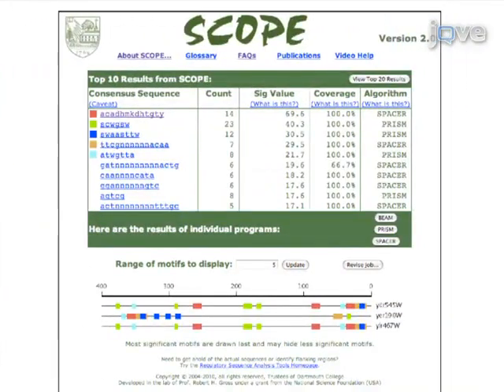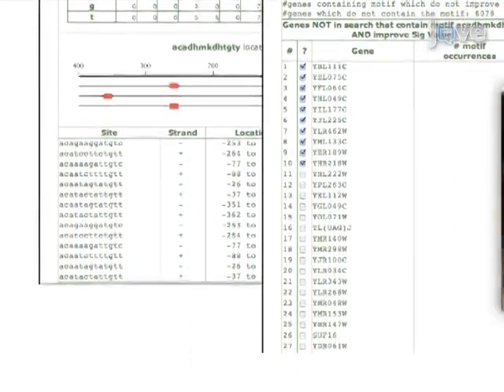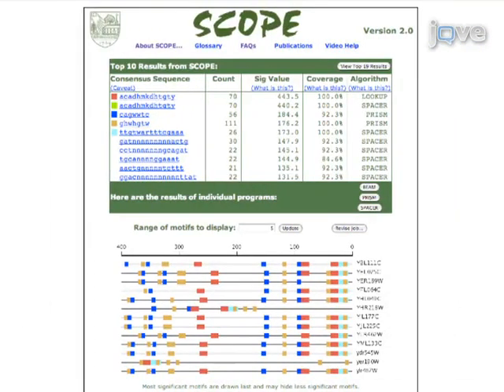As a second step, the analysis results are examined to identify high-scoring motifs. One or more motifs are chosen to investigate further. Next, the extra genes identified by SCOPE for a given motif are combined with the original gene set and resubmitted to SCOPE for further analysis. Results are obtained that show motif patterns in the new enlarged gene set.